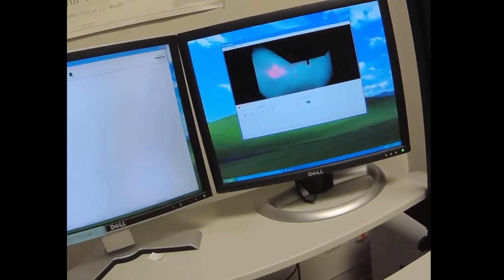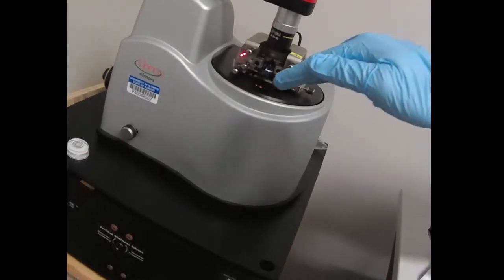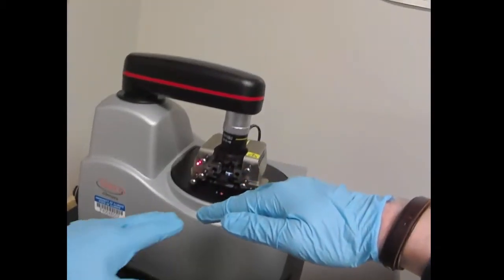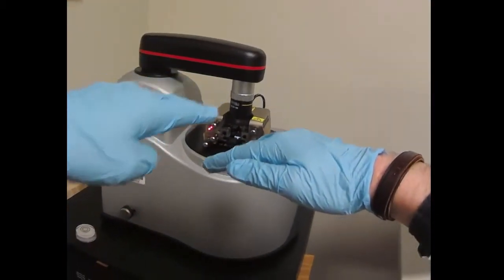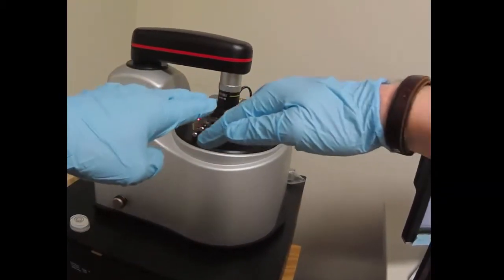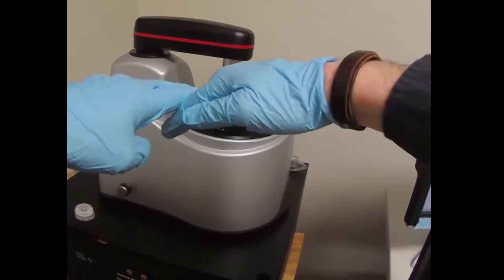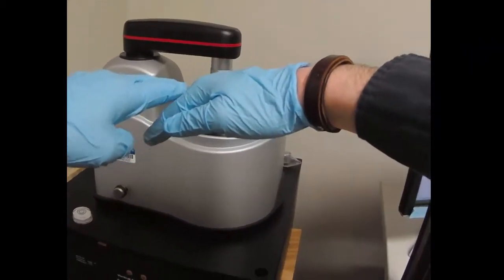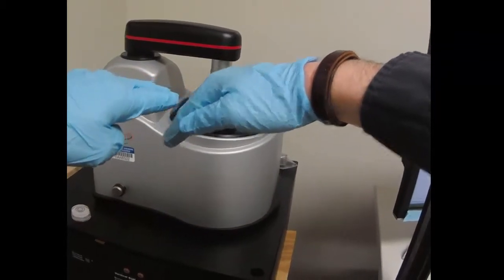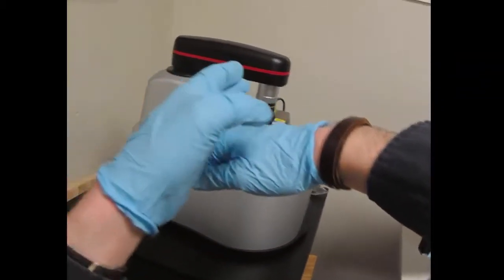The tricky part when tuning is to remember that the laser is coming from this side at an angle. The cantilever is here. The sample is here. So there's some geometry we have to do. When we shift the direction of the laser, we have to keep in mind the geometry so that if we want to hit the cantilever, the spot will be hitting the surface over here to the left of the cantilever. Actually, we might be very close.